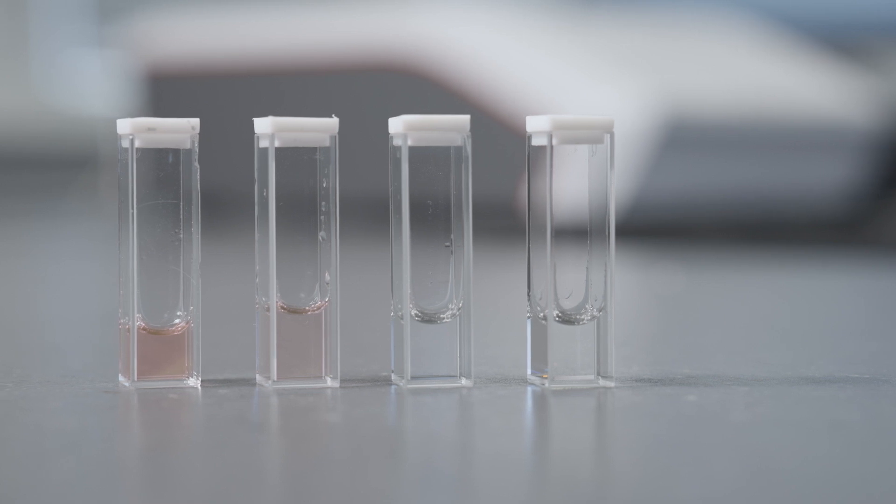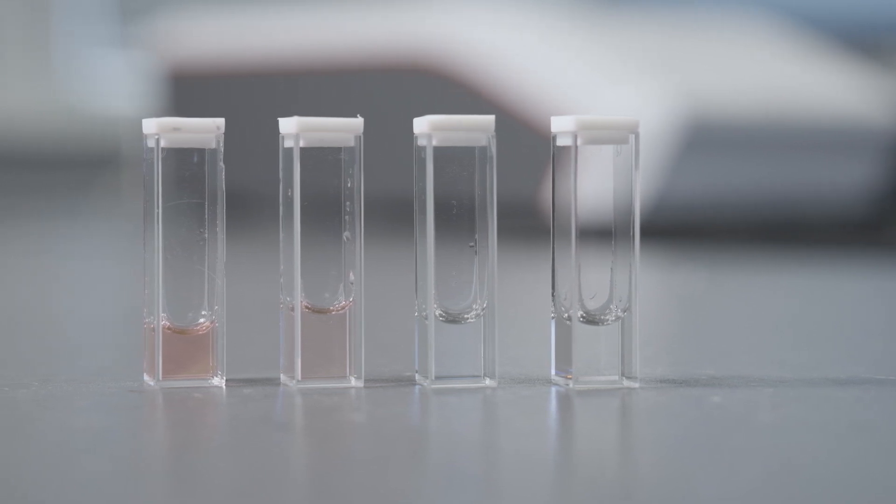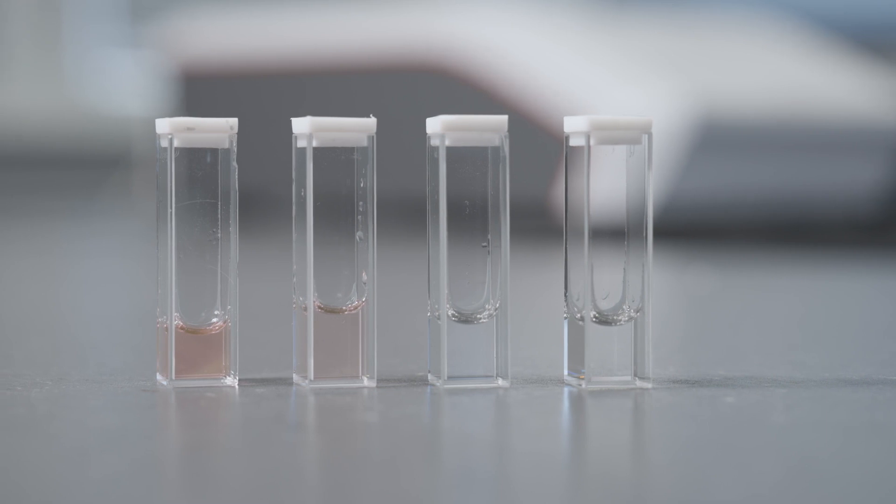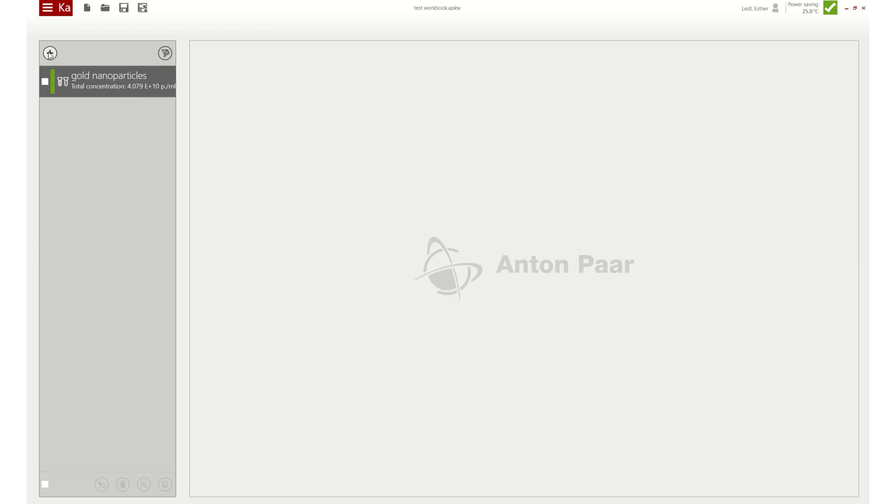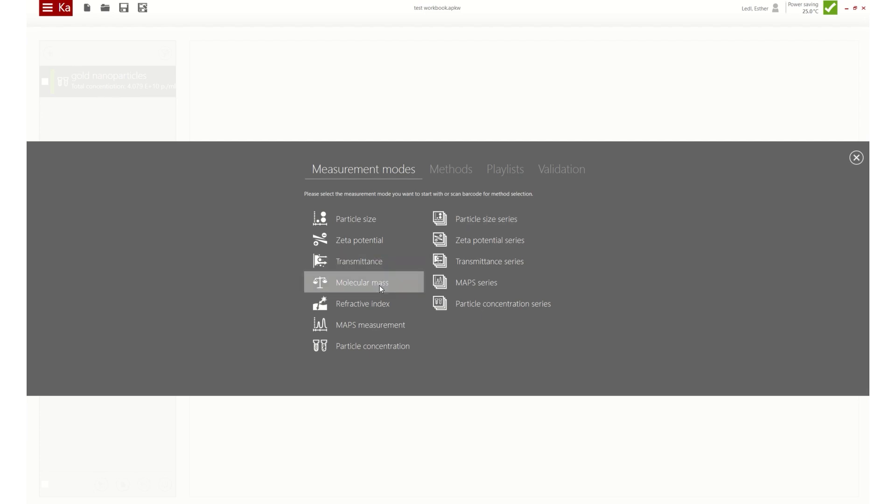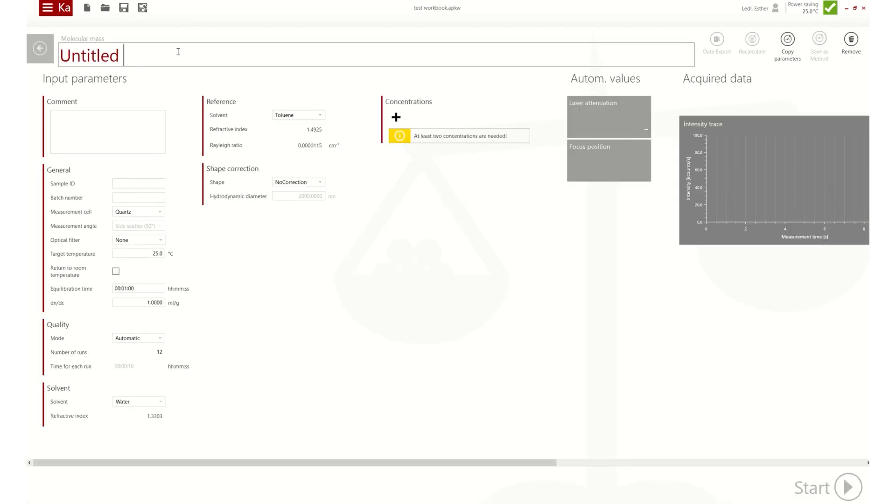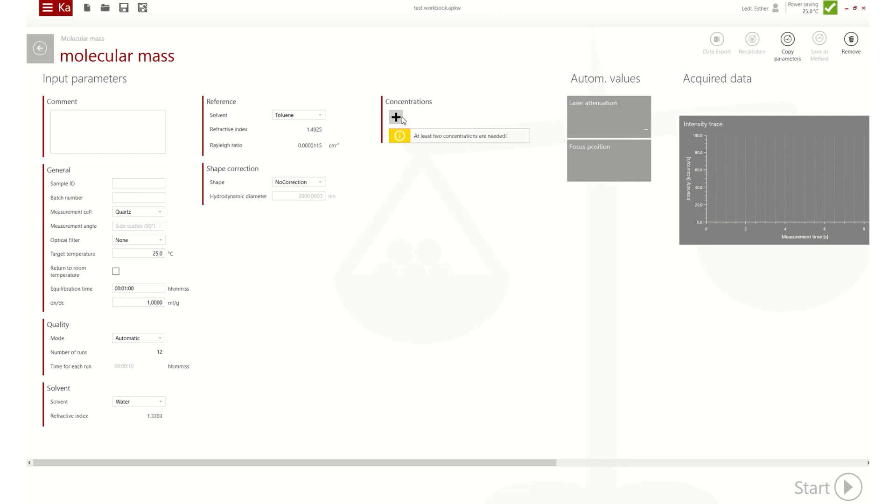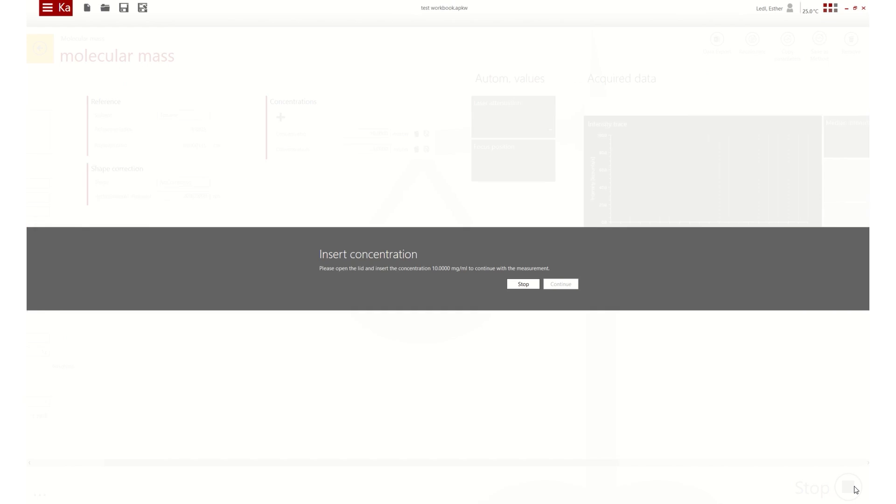Molecular mass is available for the DLS 701 and 501. At least two different concentrations in milligrams per milliliter of the same sample are needed. After the sample measurement, measure the solvent and a reference with known scattering intensity. Calliope notifies the user when the exchange of cuvettes is necessary. Use only quartz cuvettes for this measurement mode because of their optimal optical properties.